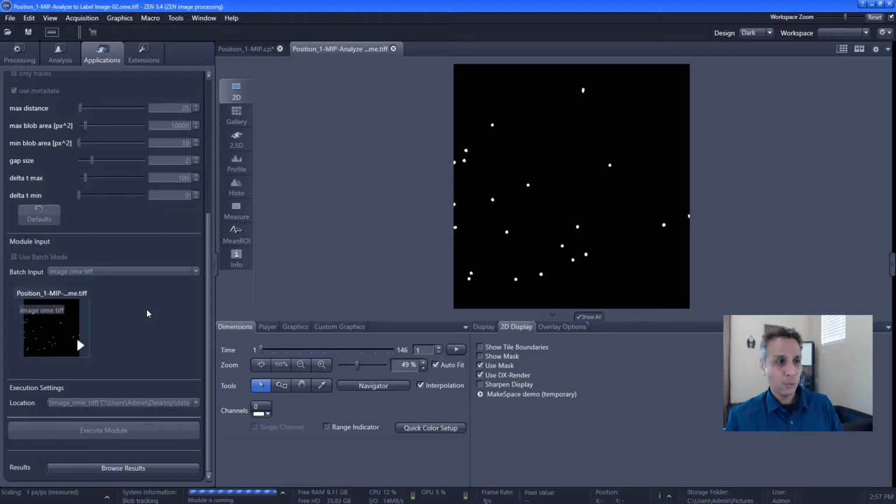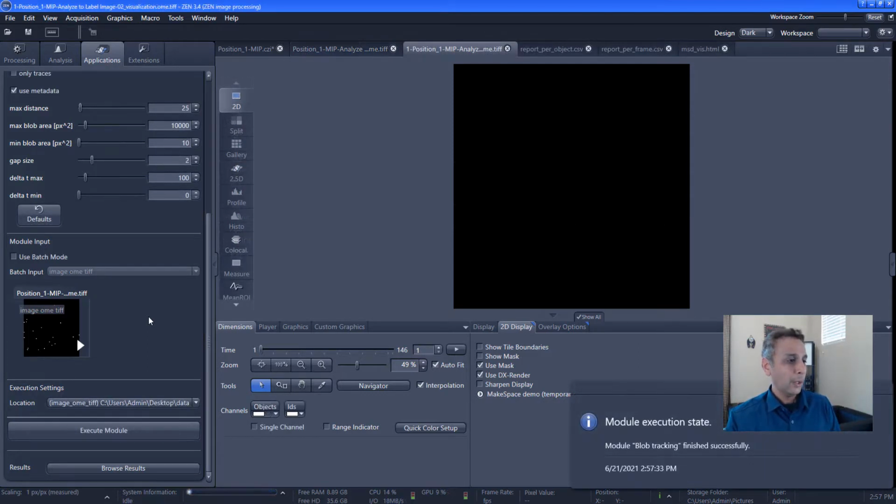This is why I think it's worth putting in however much it costs, and this is not an expensive license, let me mention. So please talk to your account managers if you really think this is useful. We have denoising modules on APEER, and we have the tracking, and more will come. And you can write your own modules. So it may be a good investment for you. Okay, so there you go.